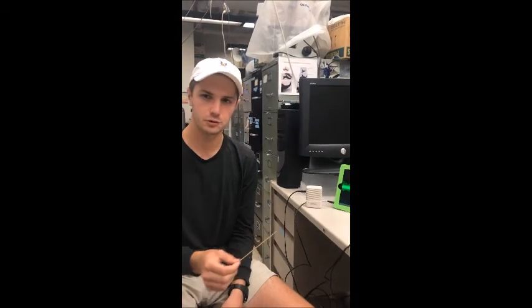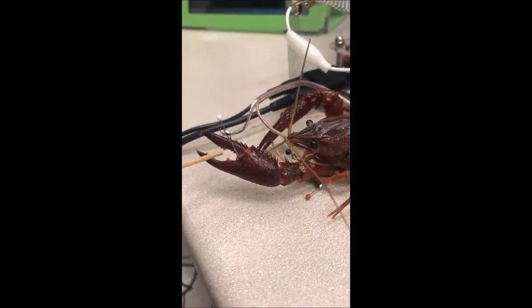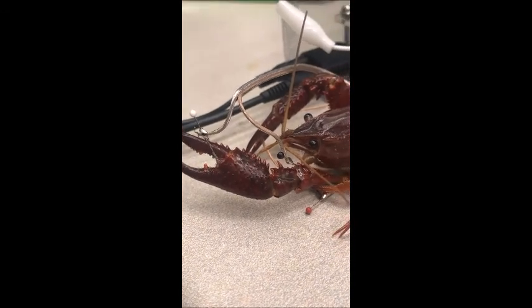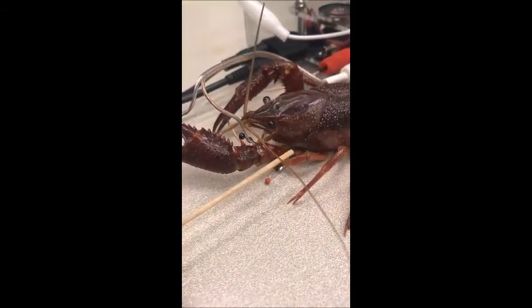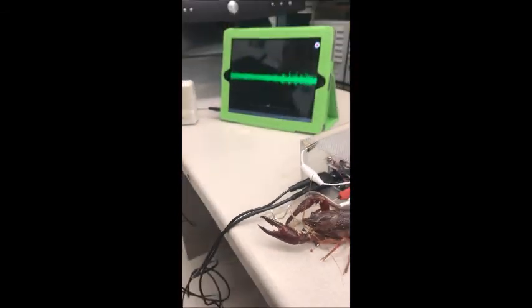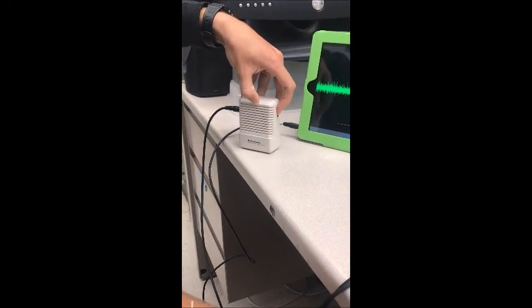So now we're going to look at the crayfish, and this is very similar to the blue crab, except there's not as many hairs on the outside here, you can see. So instead we're going to look at the tips here. To do so, we can plug little pins right here into this first joint here, and then again in the joint over here, and then you can put the ground in either the thorax or the lower leg. Now it's also a very good idea to listen to the sound, and you can turn it on like this.